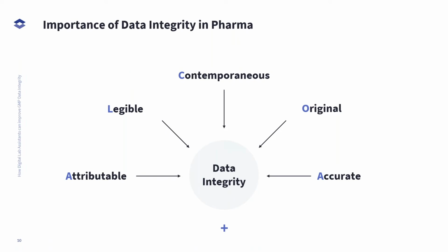It's always important to set some context before we dive into the details. So let's open with a broad discussion of evidence collection and how maintaining data integrity is crucial for presenting evidence to regulatory bodies like the FDA and EMA. So to ensure good documentation practices, we have the tool ALCOA Plus. So here's a representation of that on the slide here for reference. So attributable, legible, original, accurate, my favorite word, contemporaneous, the plus being a few extra concepts.